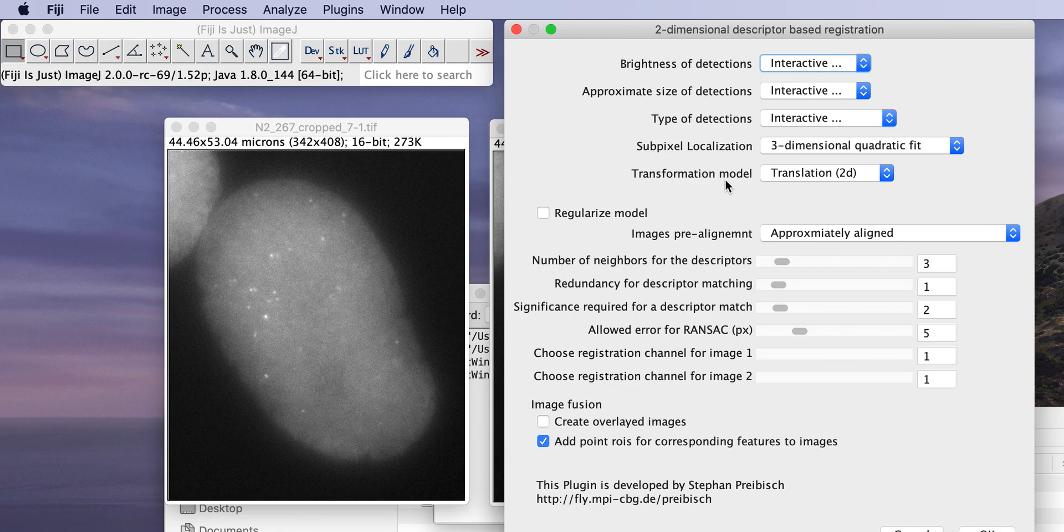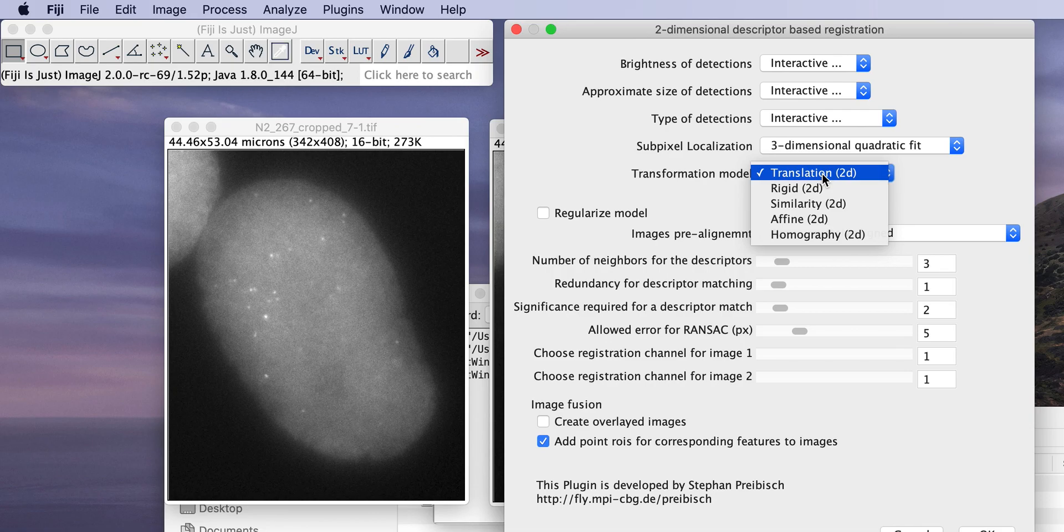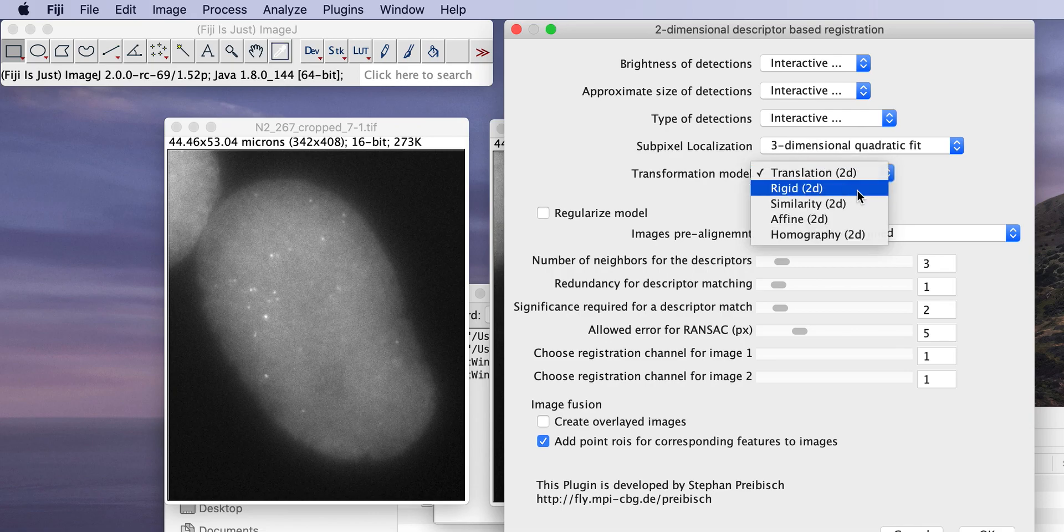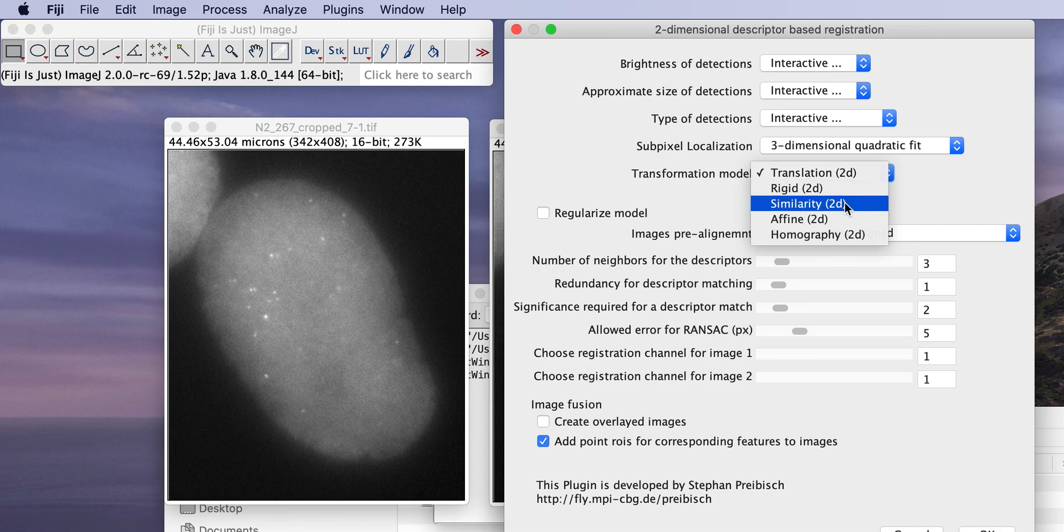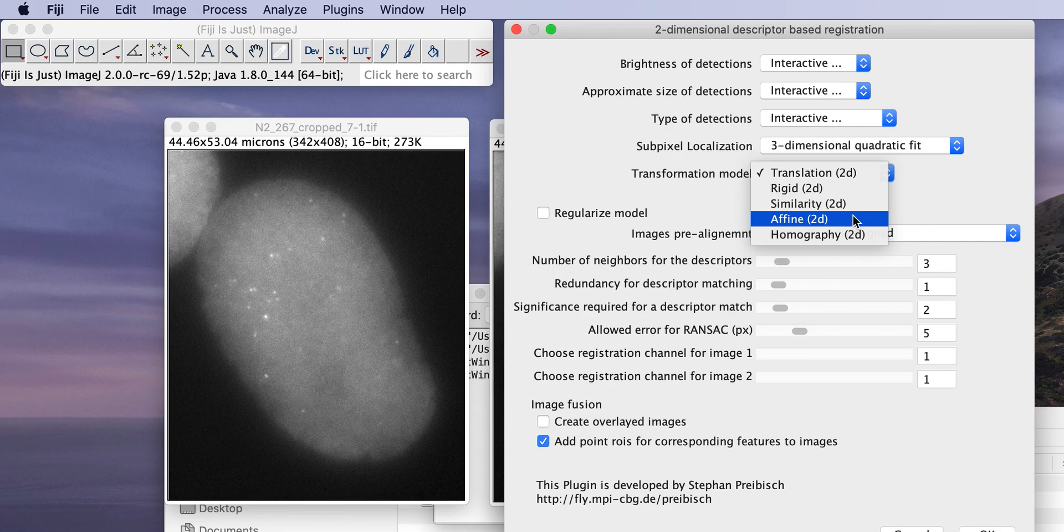Sub-pixel localization, you can leave to the quadratic fit, it's the right thing to do. Transformation model, that is a complicated question. If you just want to do drift correction, translation is right, translation does shifts. You can also do rigid, that also allows for rotation. You can do similarity, that also allows for isotropic scaling. You can do affine, that also allows for un-isotropic scaling, meaning in a 2D case X and Y can be scaled differently. It allows for example shearing as well.